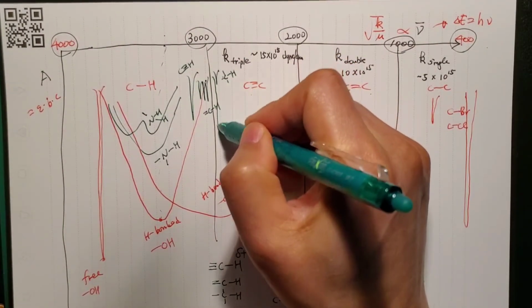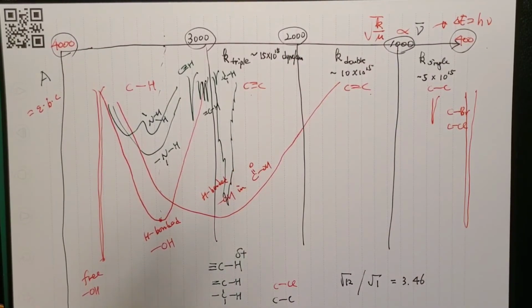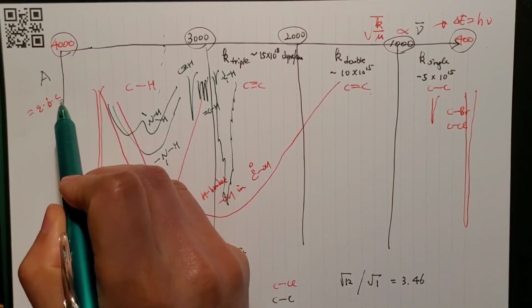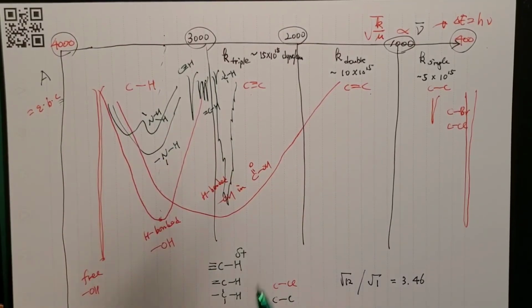You normally see huge molecules showing this type of spiky signal. Why is that? When you look at even octane, how many sp3 CH bonds do you have? A lot of them. So you have the same concentration of the molecule, but within the molecule you find this particular functional group multiple times.